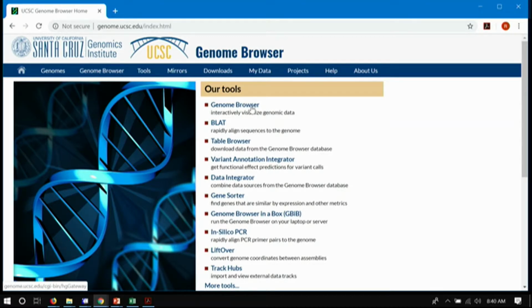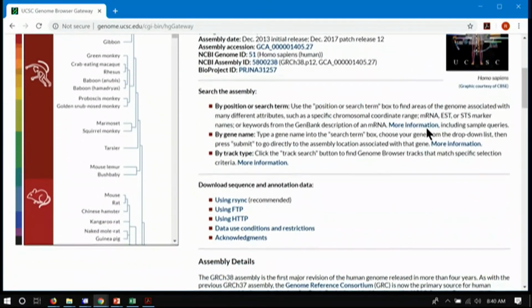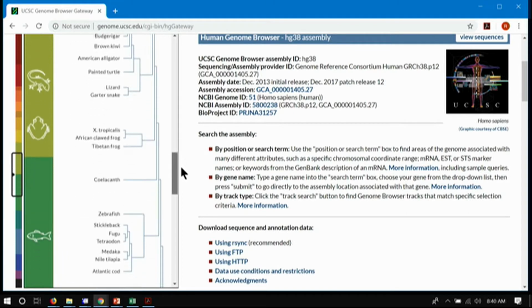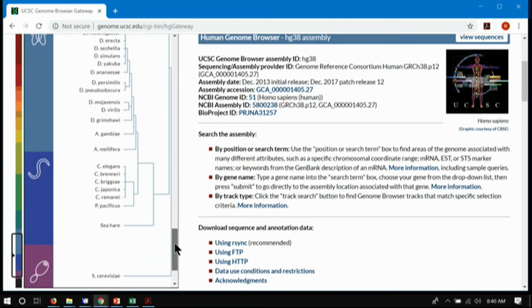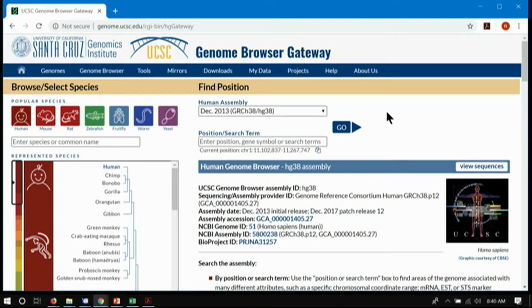So here's the Genome Browser link. Let's click to that and go to the gateway where you have the option to choose from all of the different animals that we support. We're in an evolutionary tree there because we're very big on pushing back the borders of ignorance on that whole creation thing that seems to be really popular in this country. So we lean really heavily on the side of comparative genomics and the evolutionary story that's present in the genomes of the existing animals as well.